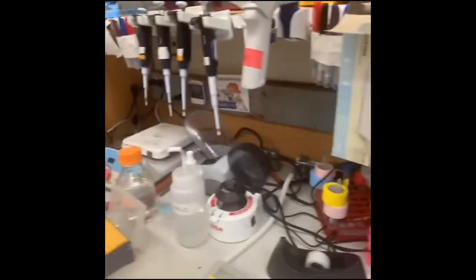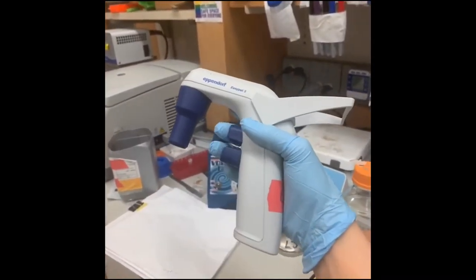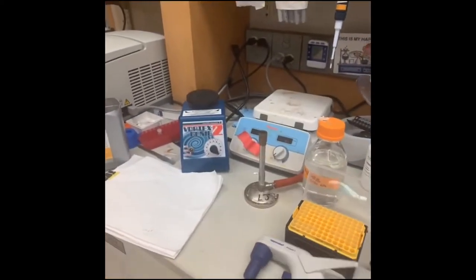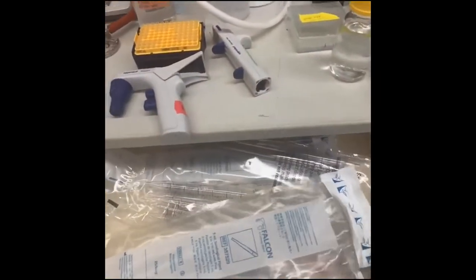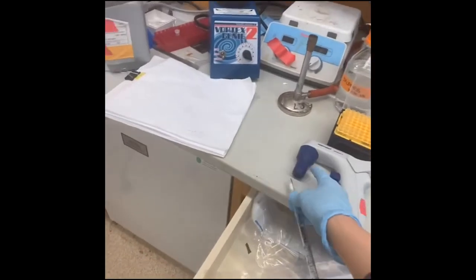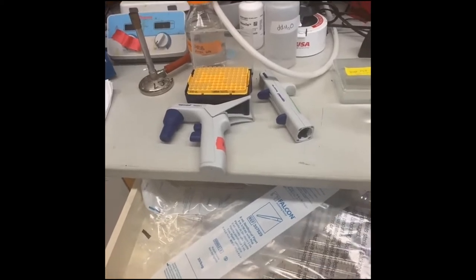We also have a lot of tubes — but before we move on, let's talk about other things. This is another type of pipette, a pipette-man. This guy actually sucks up larger amounts usually, and we have these different sizes of pipette tips that go in here. We can suck up liquid and push it out, and we use this for larger volumes of liquid.